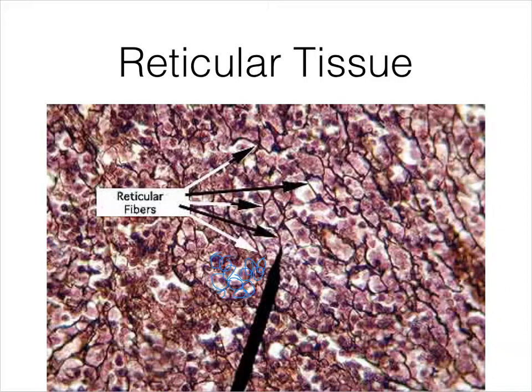They're going to be fairly densely packed, but you will still be able to see fibers, these dark reticular fibers that are branched in the background. It will not usually be a tissue that faces a lumen, so you can distinguish it from epithelial tissue by the presence of dark fibers, as well as by the section not facing any sort of lumen or open area.